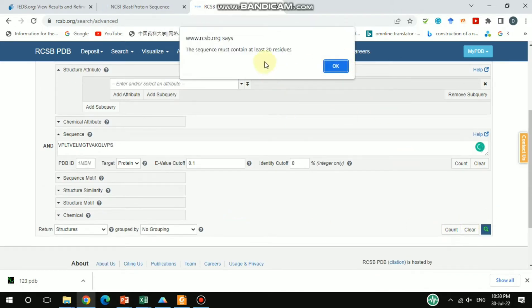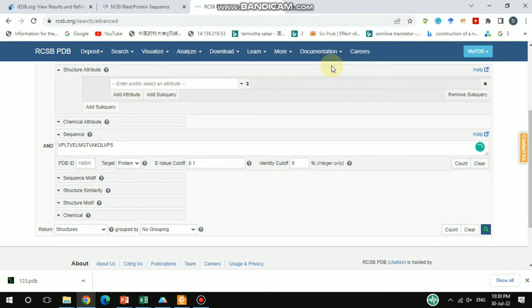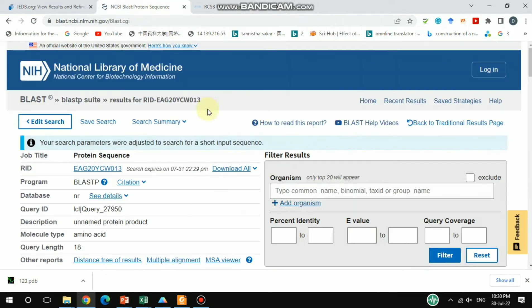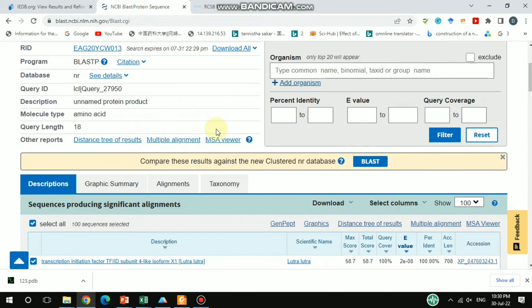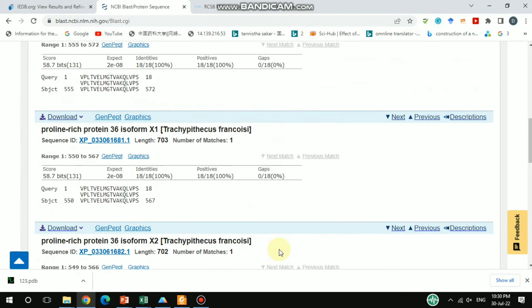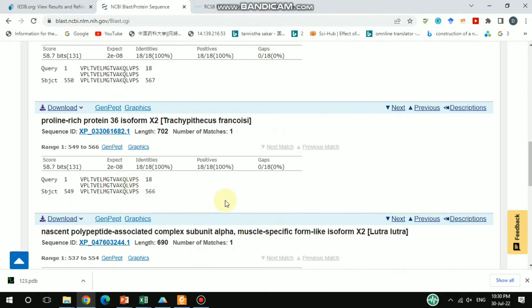It's showing that you need at least 20 residues to search — no problem, just add some more amino acids. The additional amino acids won't affect the match. Adding P, L, M — that's okay. The result has already appeared here, showing the alignment, and if you go further these are all the different sequences that match this short sequence.